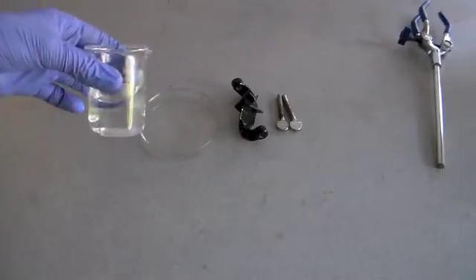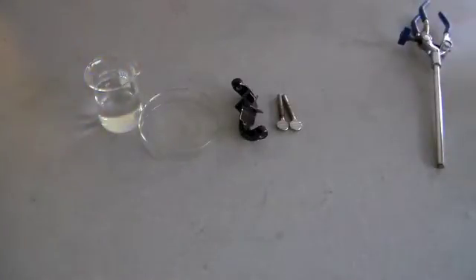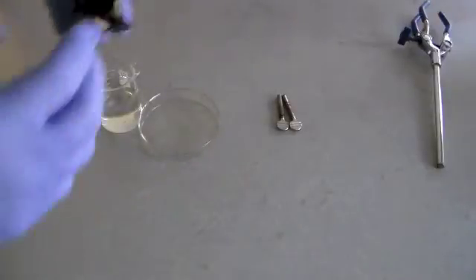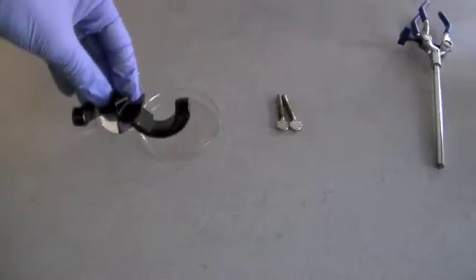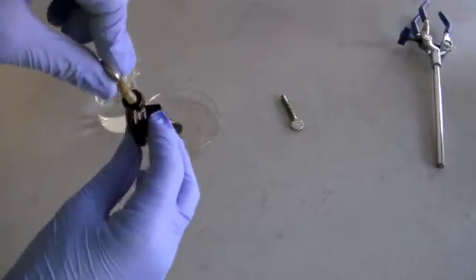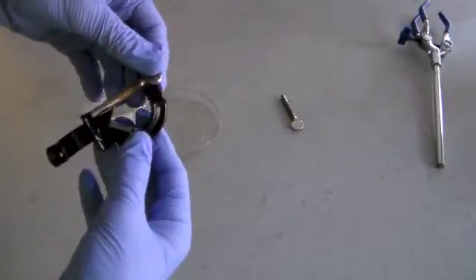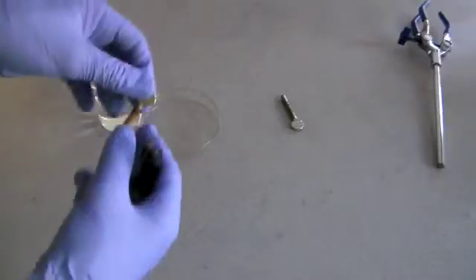This is a solution — 5% vinegar with a bit of table salt in it. This is very good at removing the oxide layer from copper, so I'm going to try it with this iron rust. I'm using a 90-degree or right-angle clamp. The screws fit in through here, but I've removed them so that they can soak — so that the entire surface can soak in the solution.